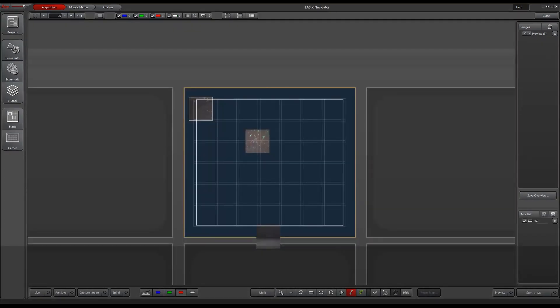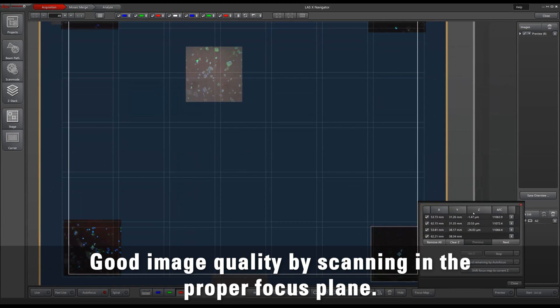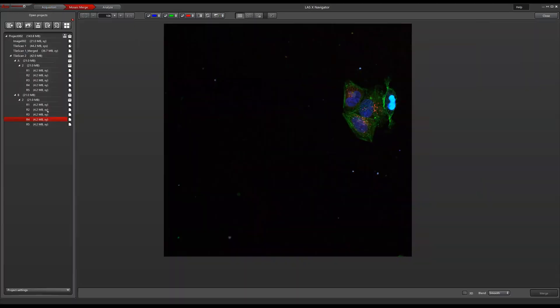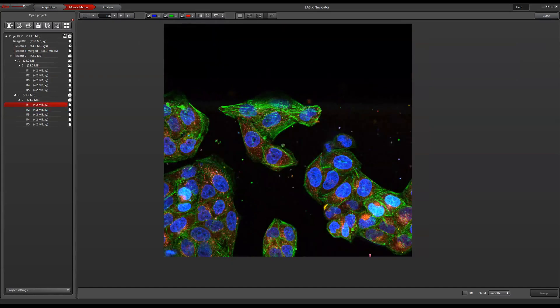For specimens with tilted surfaces, you can create a focus map by defining focus points. The autofocus tool ensures that you achieve high quality images.